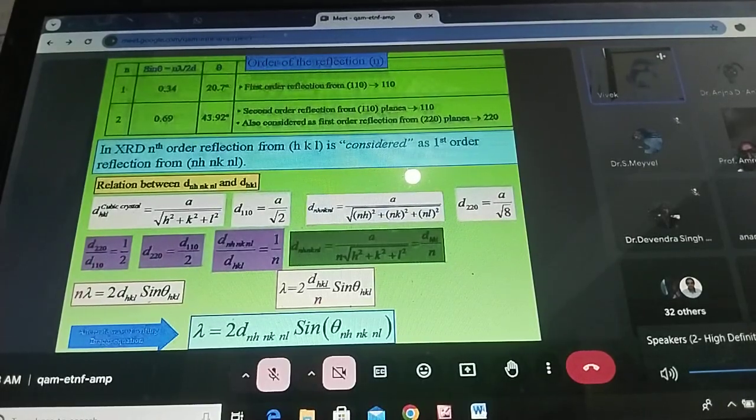So what atomic scattering factor I have to give depends on my sample, say I will write C20H20O4S1. When I solve the structure, the computer program will take the atomic scattering factors of carbon, hydrogen, oxygen and sulfur only, not any other. Sulfur and chlorine, if you can say. Even if I wrongly plot it as, say, titanium, I have a distance table in my hand. I can say the carbon sulfur distance is 1.66, and the carbon chlorine distance is 1.75.